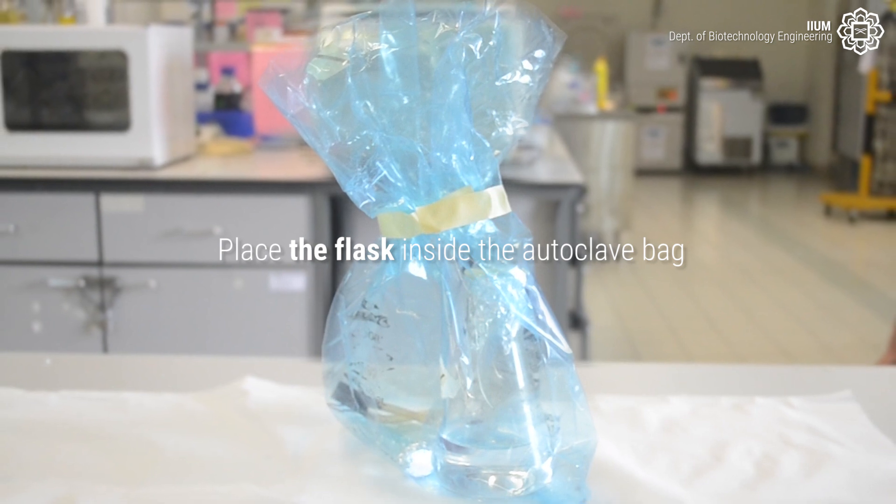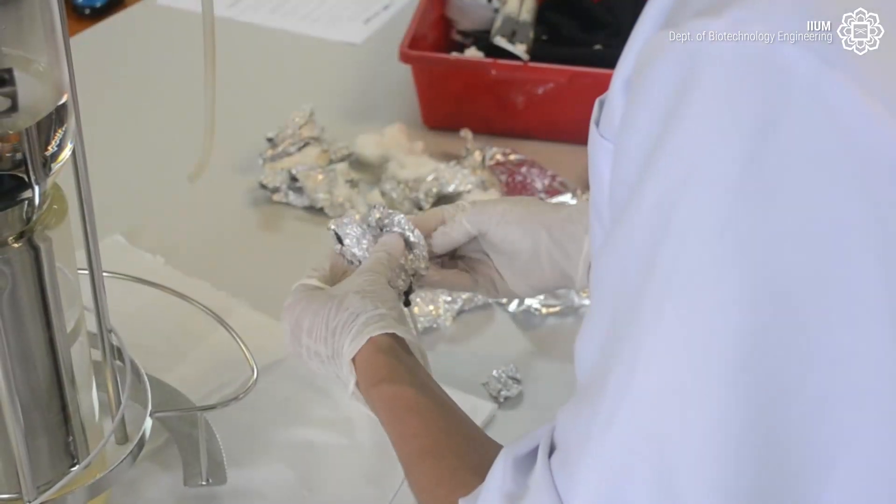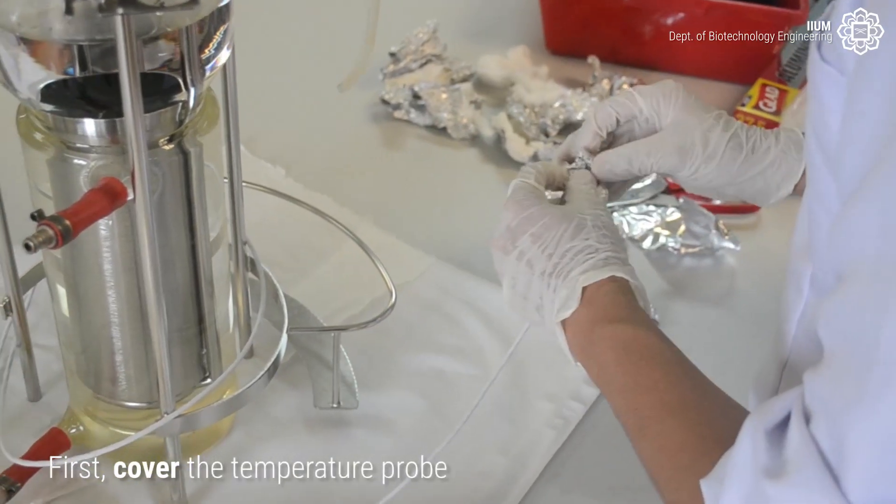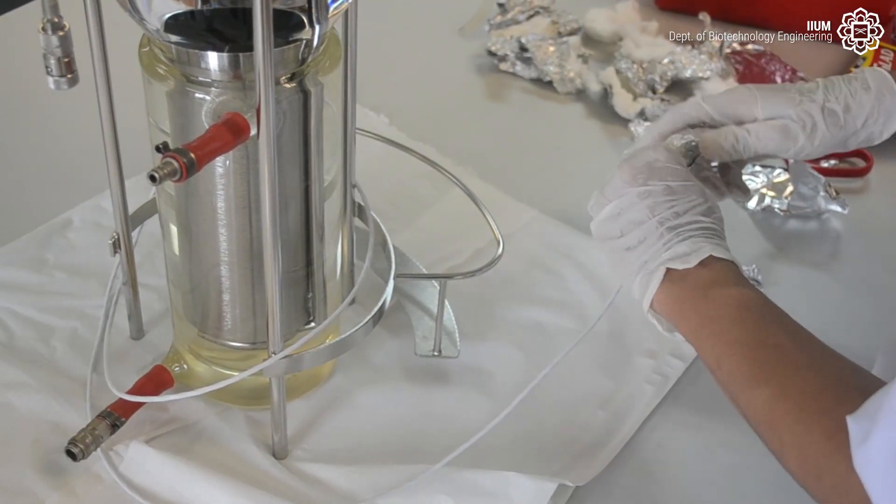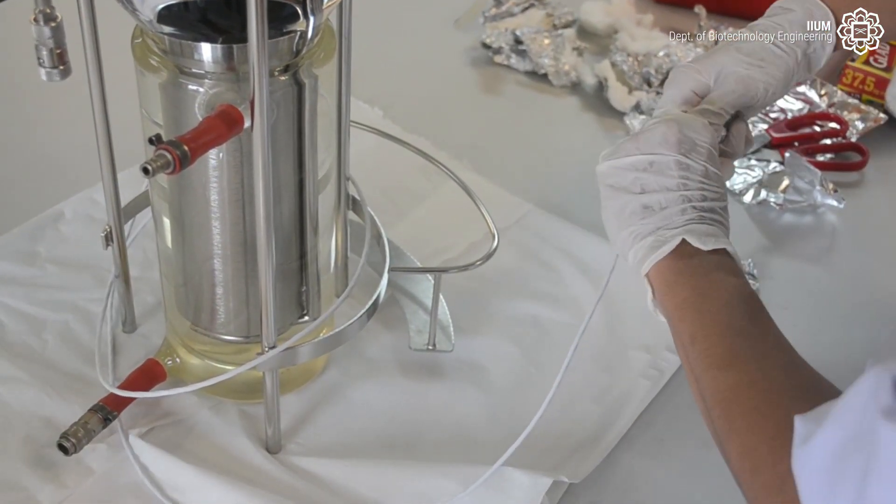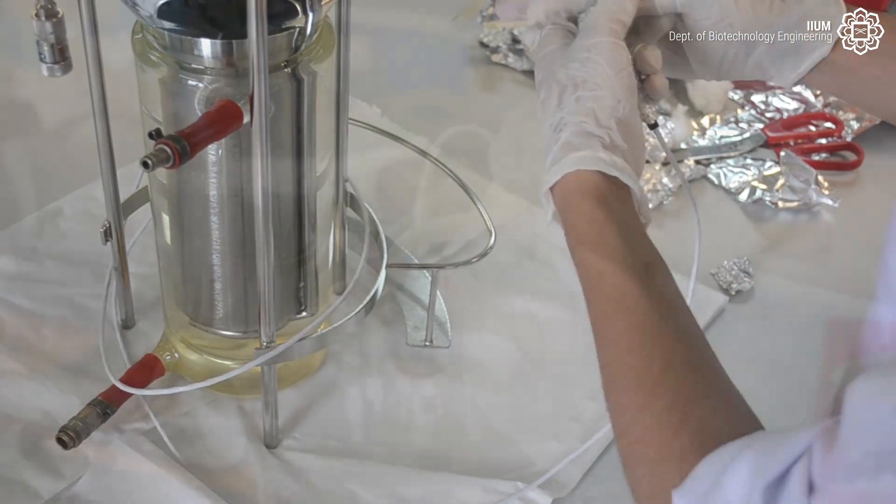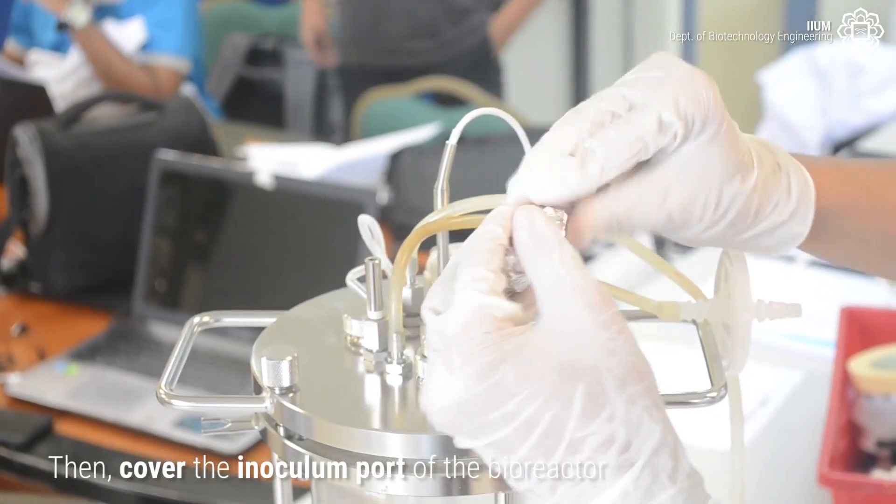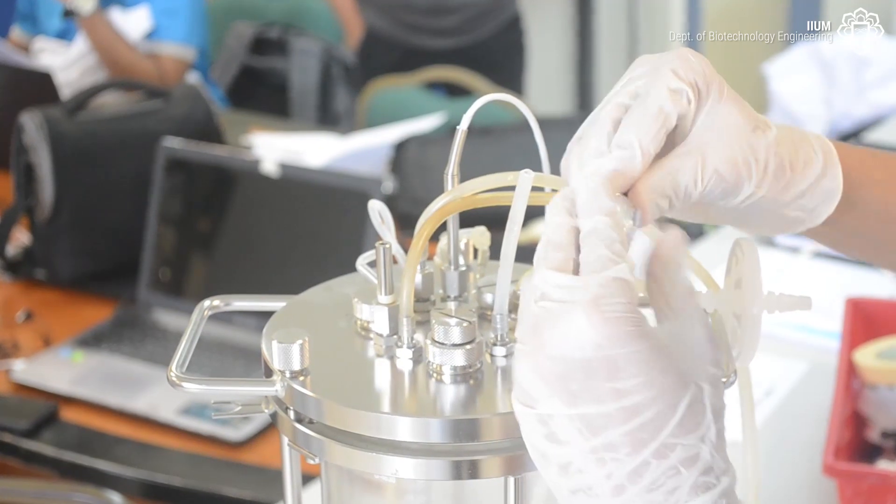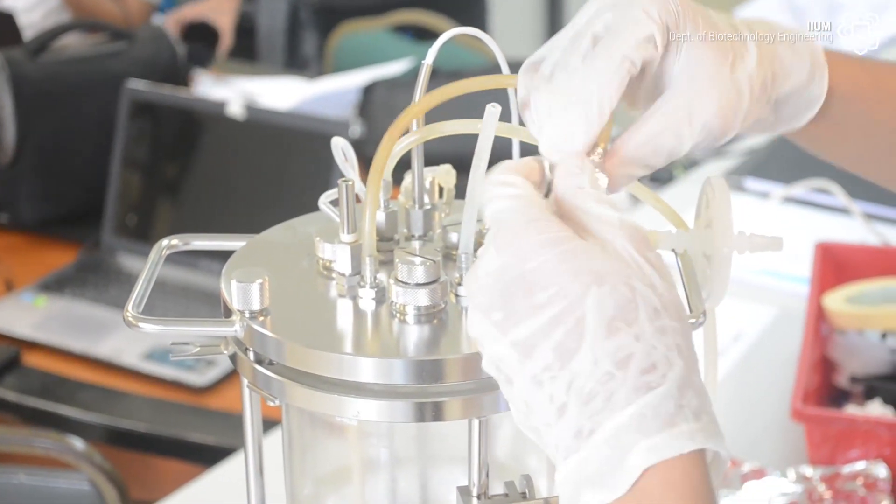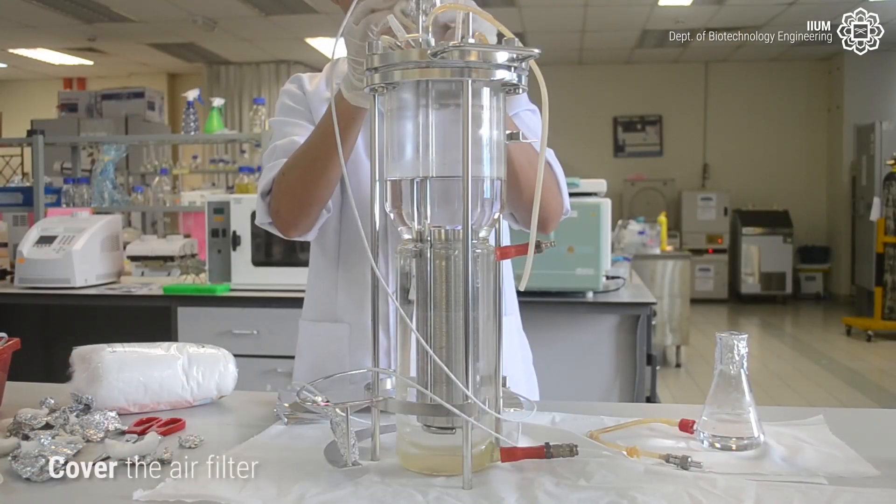Place the flask inside the autoclave bag. Then prepare the photobioreactor. First, cover the temperature probe. Then cover the inoculum port. Cover the air filter.